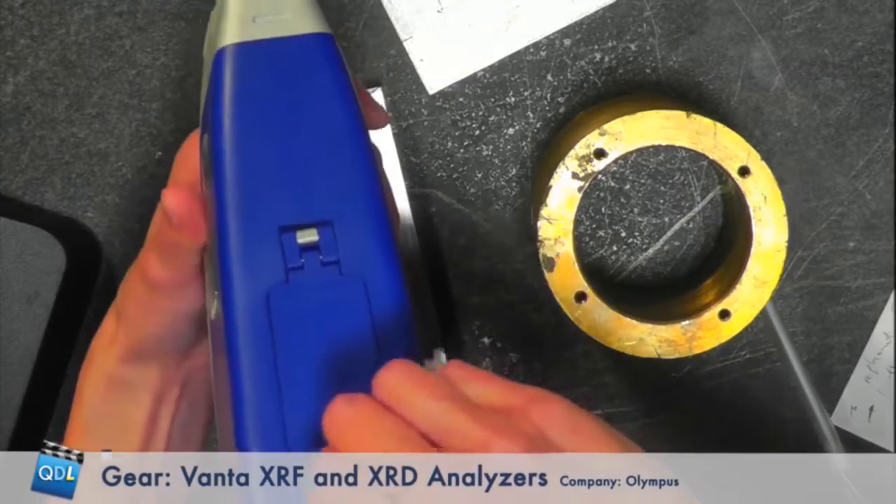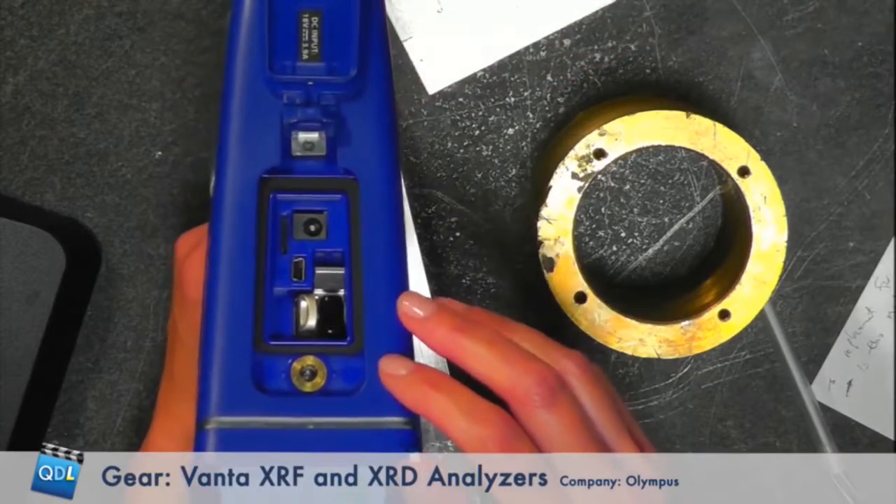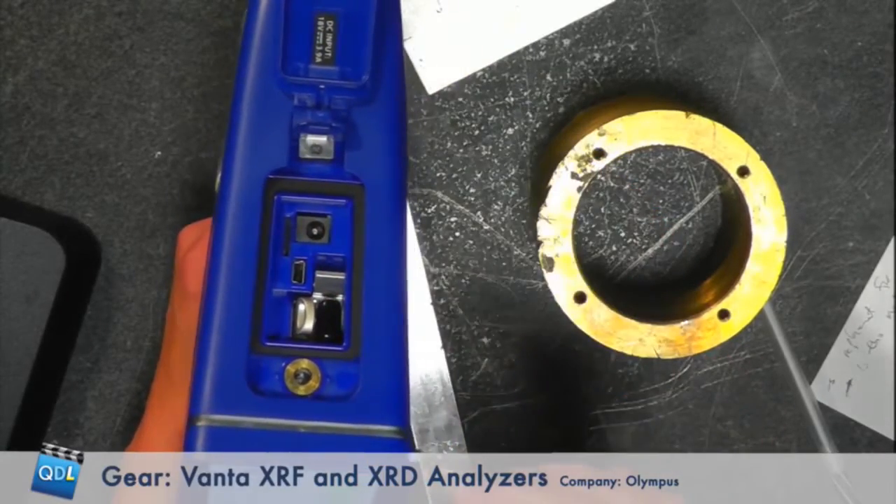All this data is obviously being stored within the unit. Data management is extremely important in manufacturing and maintenance situations. When you invest in one of these analyzers, it's not just to pull the trigger and see the answer — it's about archiving data, having a historical record, traceability, creating reports, and further analysis. The Vanta has several ways to easily download and export data. There's an IO port, and you can download via Wi-Fi or Bluetooth, a flash drive, direct USB connection to your computer, or an SD card — pretty much any way you want.